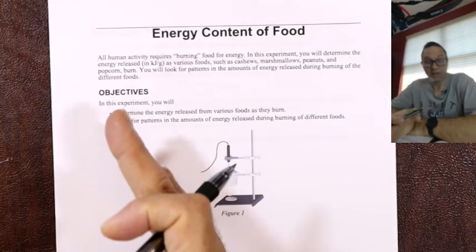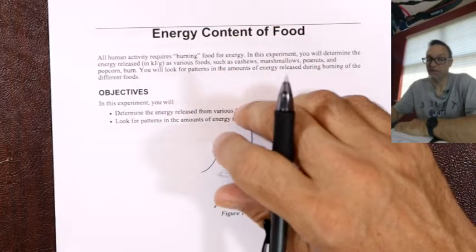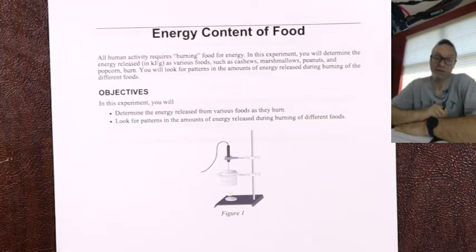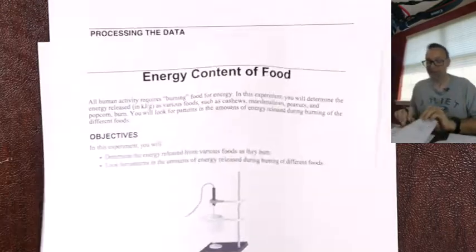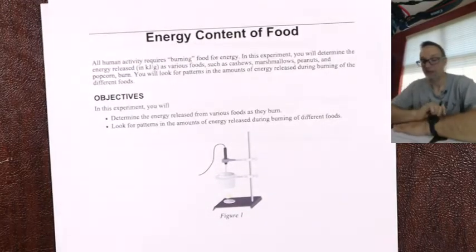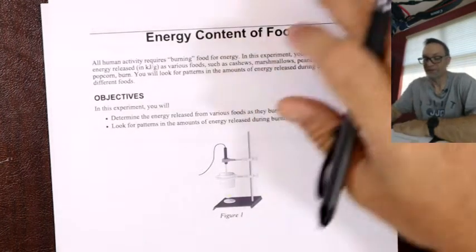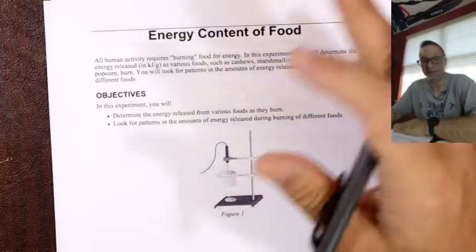So remember what you do with these experiments. You download the packet from Canvas. Go to that Chemistry 101 group site, download the experiment, and then head over to the Pivot site, and it's like a demo of a student doing the experiment. You record data in the packet, and then you analyze that data. It's not so bad in terms of emulating a lab experience. I kind of like it. It's better than a virtual lab. You've seen those things? Not good.